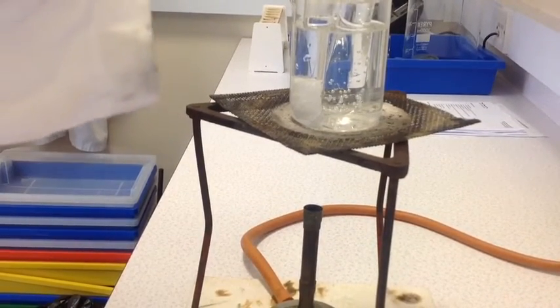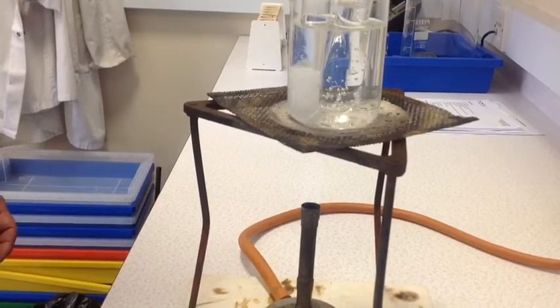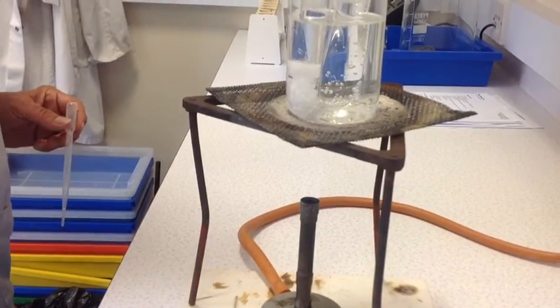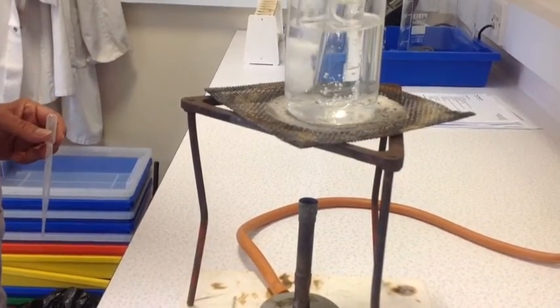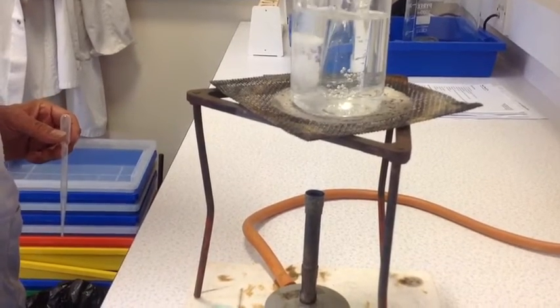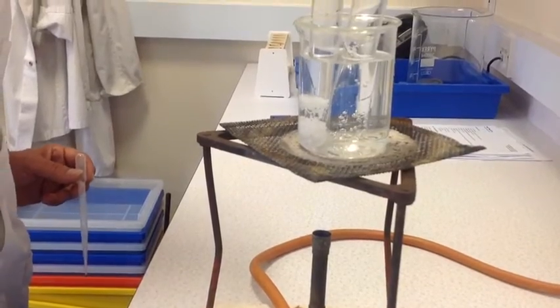The protocol says to shake the boiling tube in the water bath, which you can do. You can also, if you find it easier, stir with a glass rod gently, which I might well do actually.